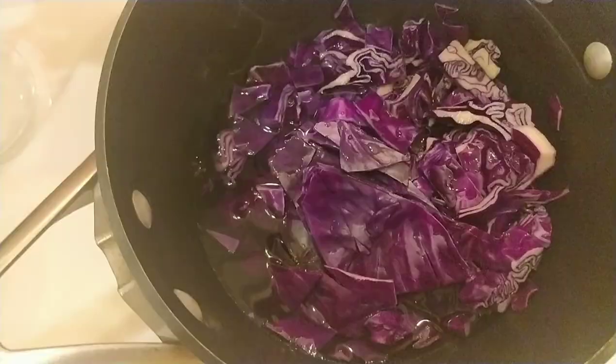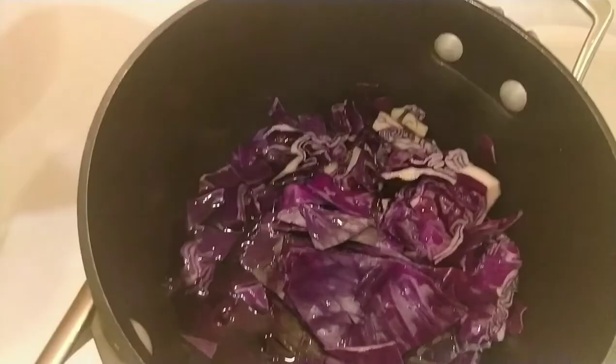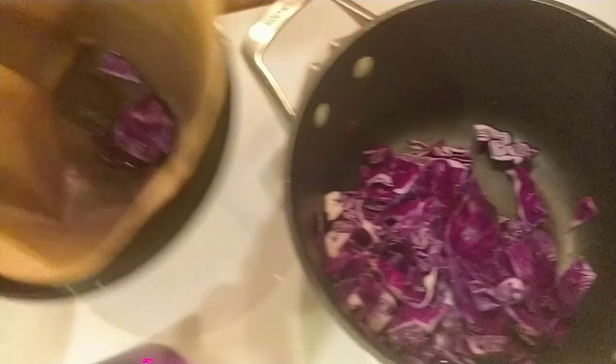My Erlenmeyer flask is over here and I'll set that up. It's been 10 minutes now, and I will pour it through this filter into the flask. I just finished pouring the cabbage juice through the filter — it's all in my flask and now I'll go take it for testing.